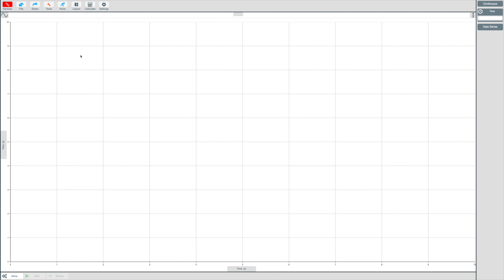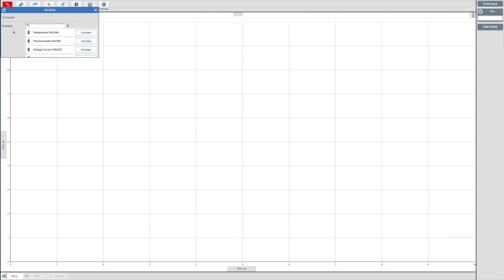To begin recording data with the EasySense 2 software is a very simple process. Simply connect your device by clicking on the devices icon, select your device from the list of available devices. In this instance, we will click on temperature.